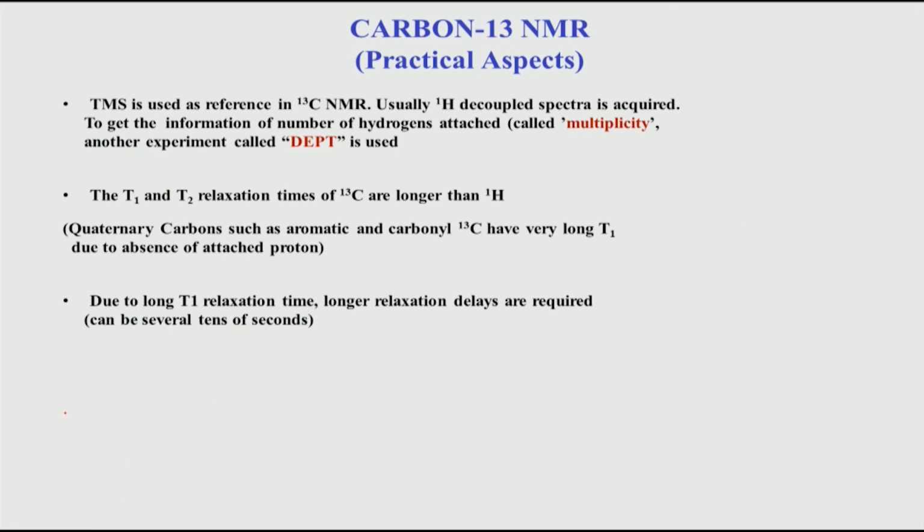If you look at this, what we are talking about is a pulse followed by an FID, okay, and this portion is called relaxation delay. And this is relaxation delay, and what happens is, after the end of this cycle you go back to this position and this is repeated n times, and that is called n scans.